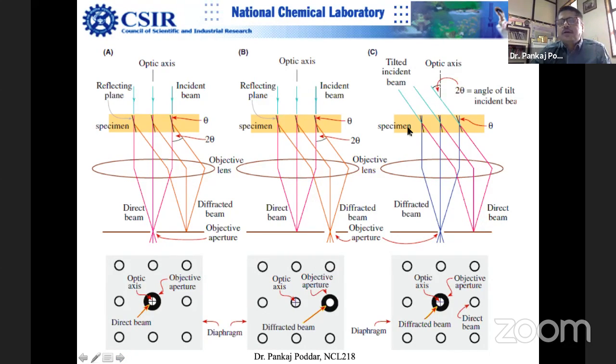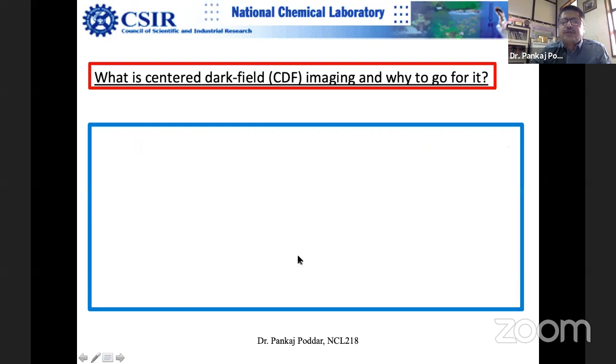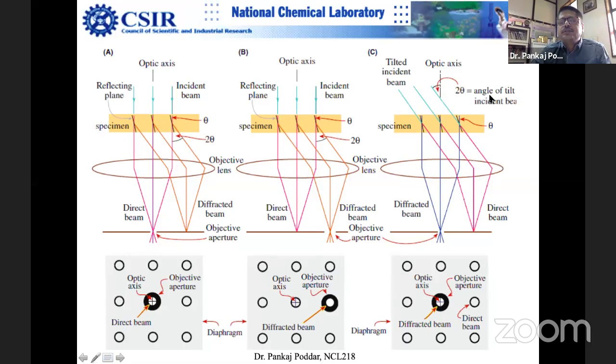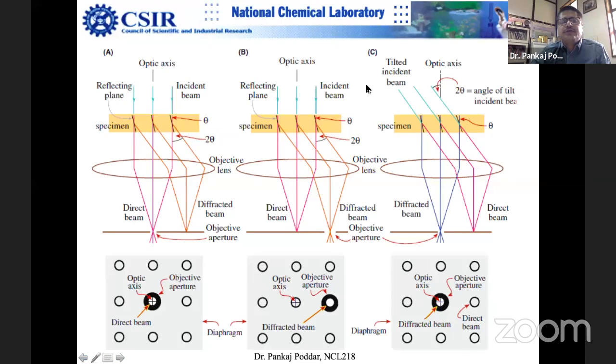This is called center dark field operation, CDF. And this is called aperture shifted dark field, or displaced aperture. This is not a very favorable thing.